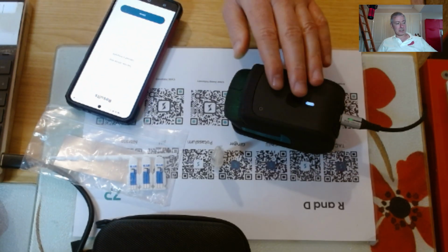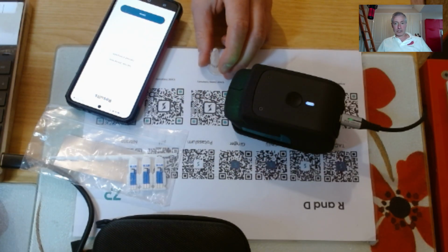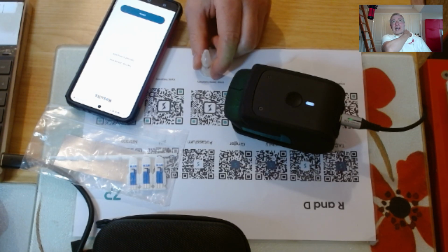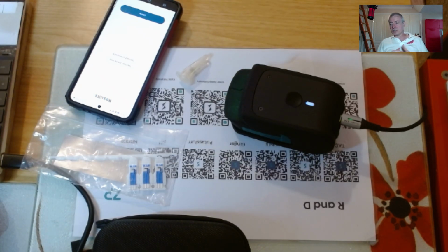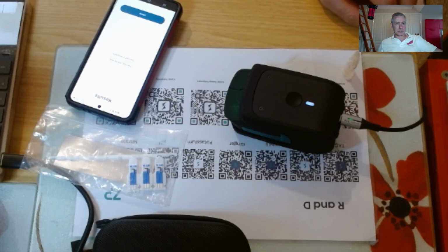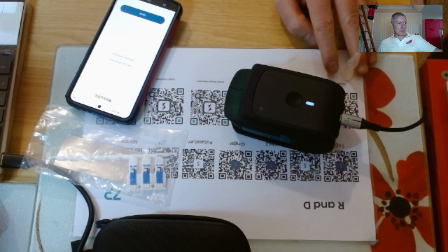If you're not familiar with this, we're going to be measuring a chili sample. It gives us results in Scoville Heat Units, and it also gives it in micromolar as well. I think it's just a historical accident that we're giving it in micromolar. We were giving it in micromolar, ppm and Scoville Heat Units. Most of the industry is actually using Scoville Heat Units. I've only come across one HPLC test house where they gave the answers in milligrams per something like 100 grams, which is quite unusual. Maybe other places would do it in ppm, but most people are actually doing it in Scoville Heat Units.